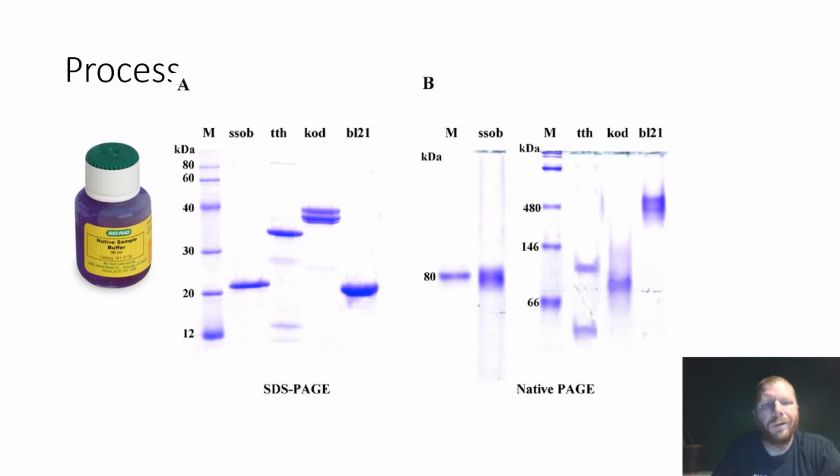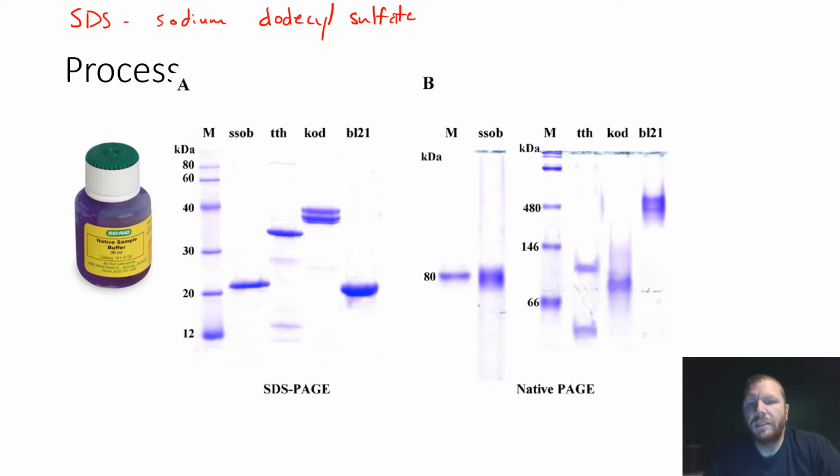PAGE. One major difference in terms of the name is SDS stands for sodium dodecyl sulfate. But PAGE still stands for polyacrylamide gel electrophoresis. Okay, now that SDS dissolves hydrophobic regions of the protein and breaks non-covalent ionic bonds.